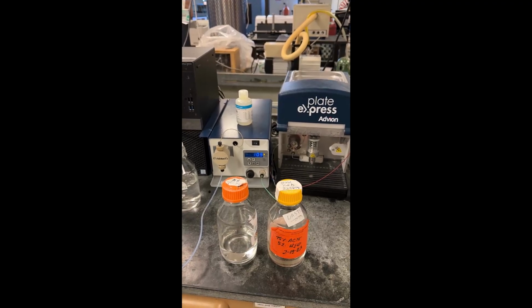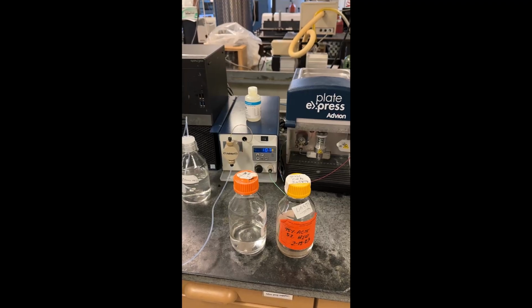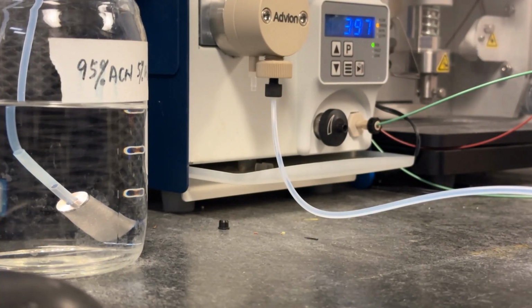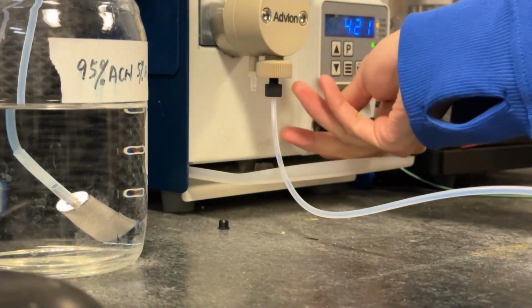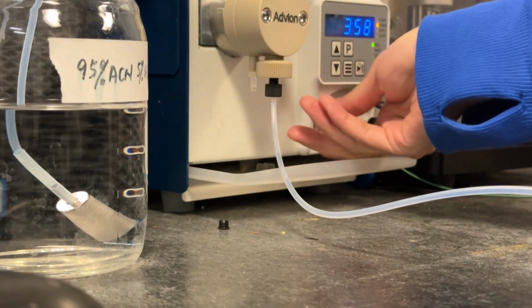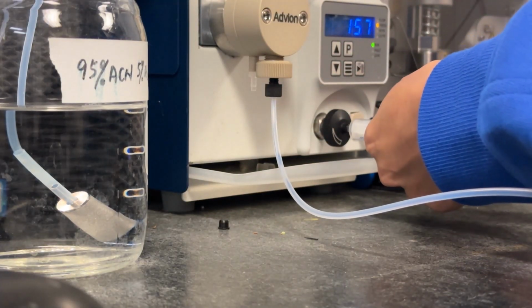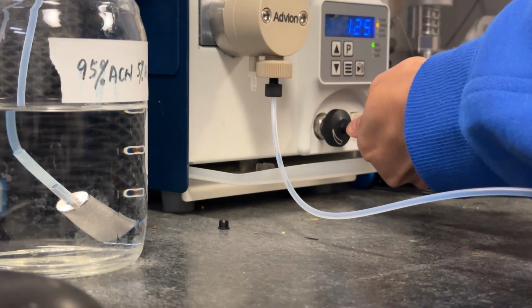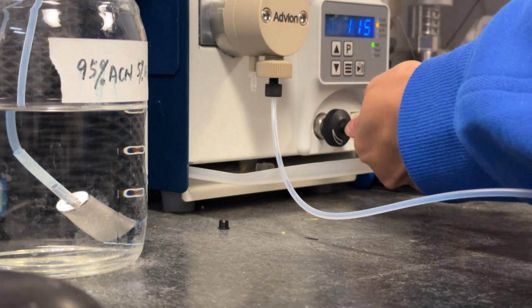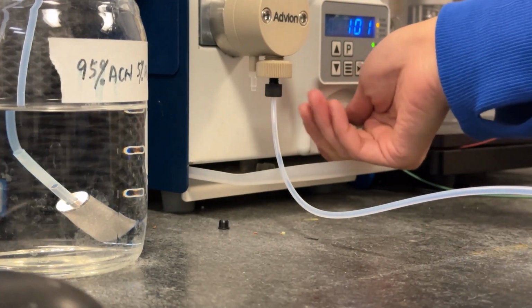If the pressure exceeds 2500 psi, turn off the pump and ask for assistance. If the pressure does not increase to the expected range, pause the pump. Open the black purge valve by turning it counterclockwise and suck any air bubbles out by using the plastic syringe. Then close the purge valve and turn on the pump.